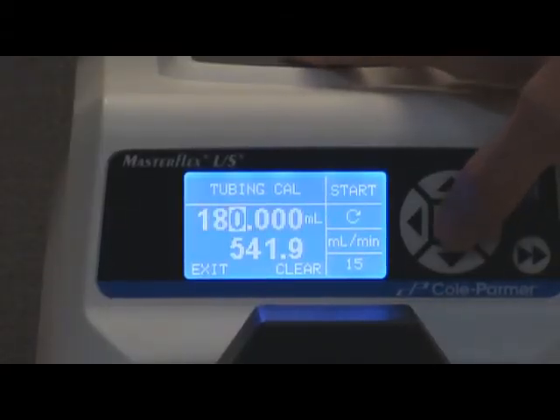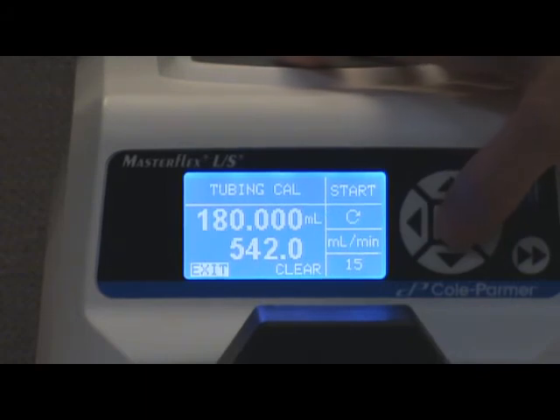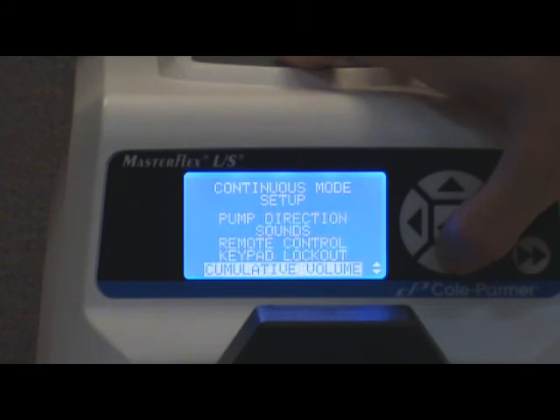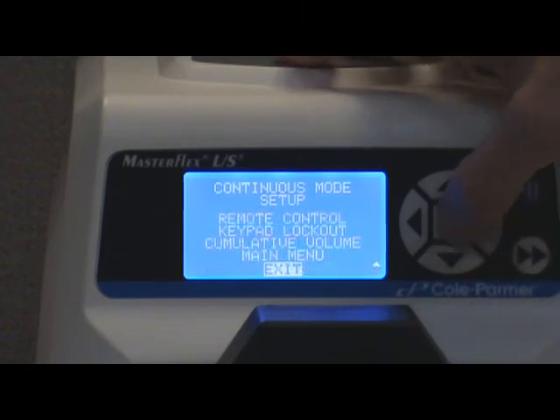Highlight exit and press enter to lock in the calibration. From here you can leave the main menu by scrolling down to exit and pressing enter. This will take you back into the mode you were previously in.